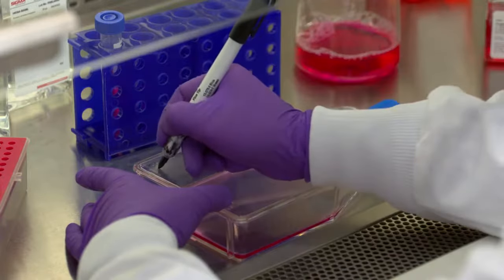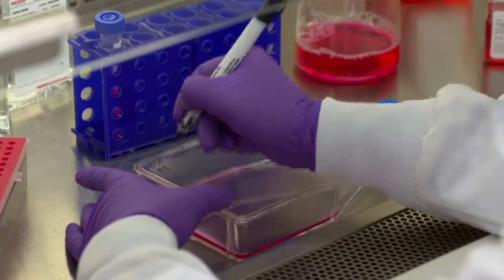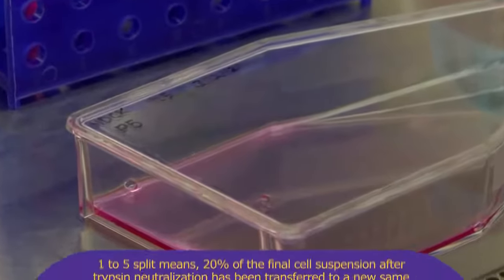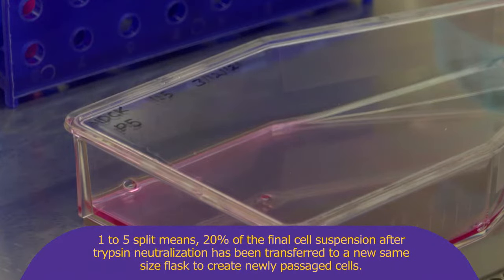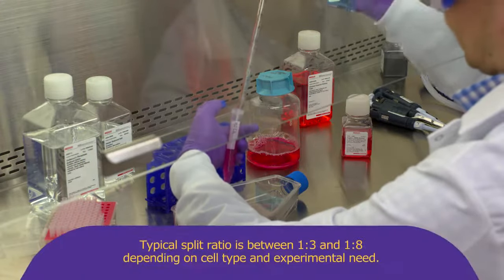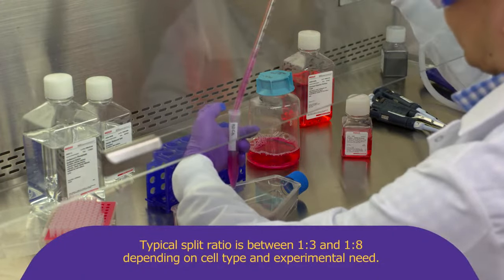For routine passage of cell lines with a known growth rate, it is not necessary to count cells. One can simply use a split ratio when passaging. For example, 1 to 5 split means 20% of the final cell suspension after trypsin neutralization has been transferred to a new same size flask to create newly passaged cells. Or in other words, cells from the original flask has been split into 5 equal size flasks. Typical split ratio is between 1 to 3 and 1 to 8 depending on cell type and experimental need.